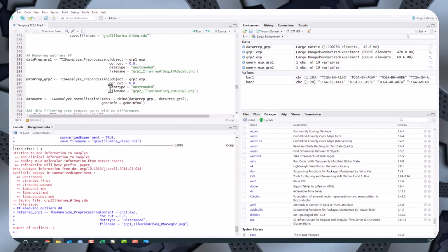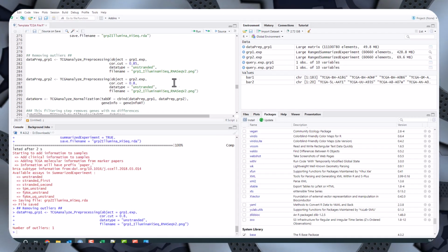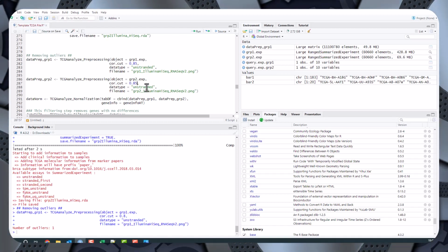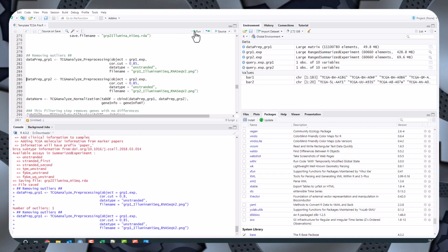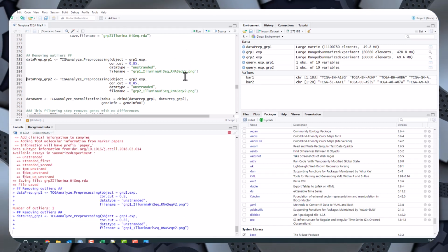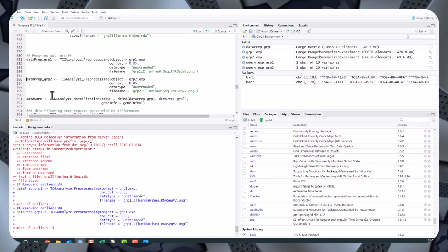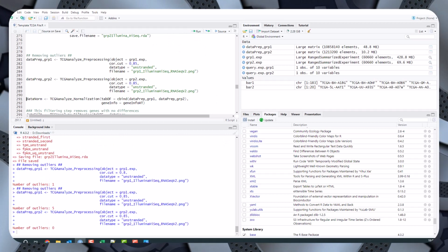So I'm going to adjust this to be 0.85 to exclude the data that I think is a bit questionable. If I change it to 0.85 for one, I should change it for both sets of data. So this is first for the stage 1. Now I've removed 5, and this is stage 2, and I've removed none.